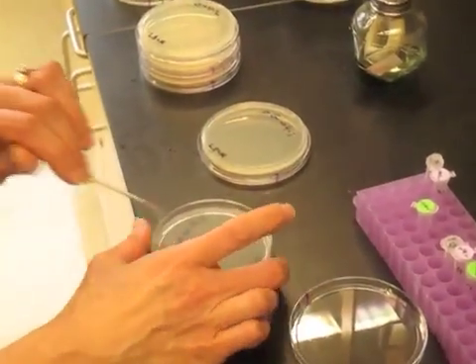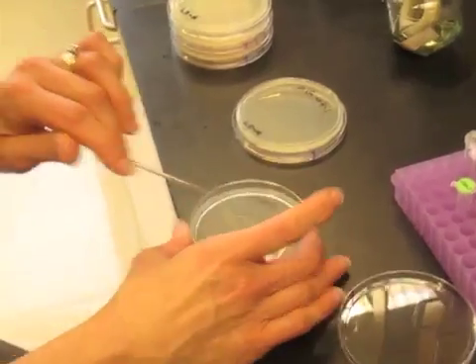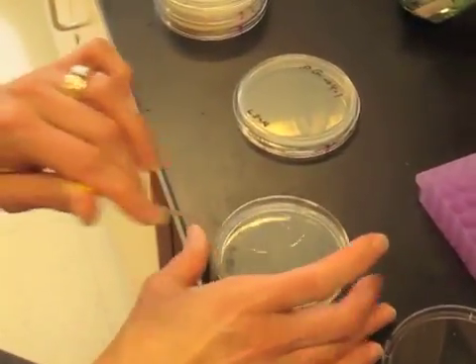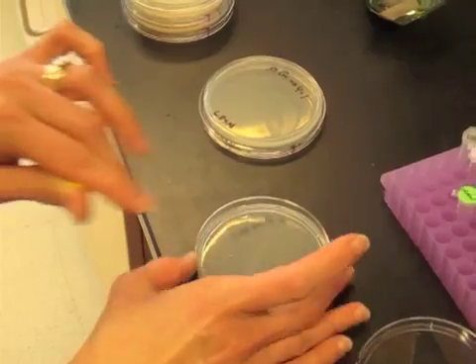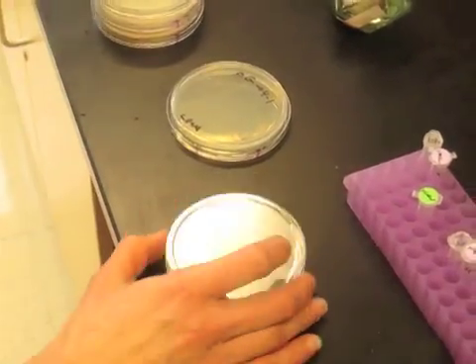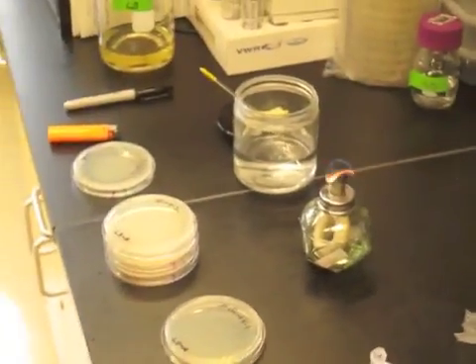Then you can spread the liquid on the surface of the plate like that. It just needs to be spread around a little bit and then allowed to sink in before you turn them upside down to grow overnight.